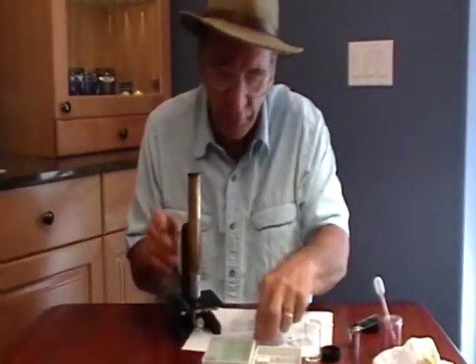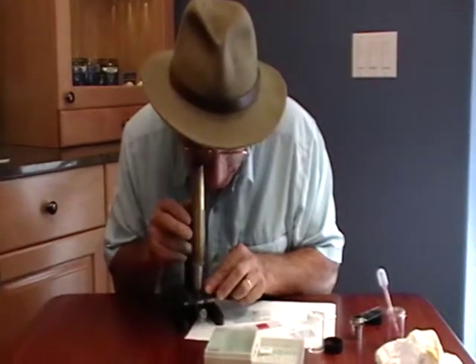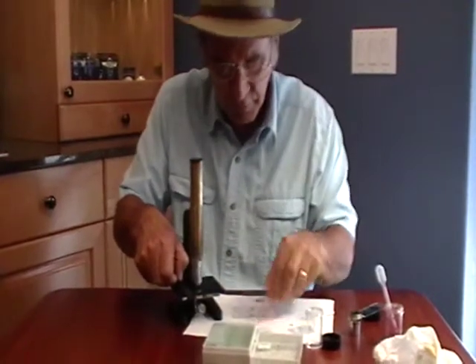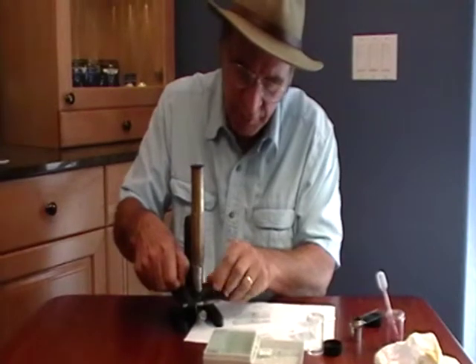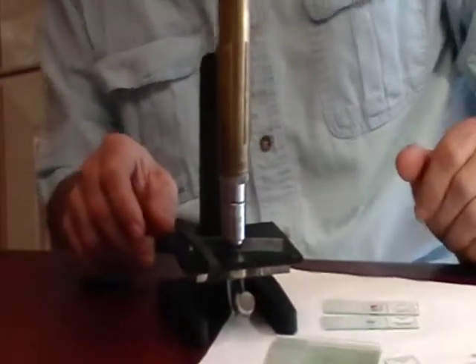Now if you were already in focus with the prepared slide — which is what I am right here, more or less — I can then take the slide I made and very carefully slide it under my universal rubber band here, which comes with the microscope.